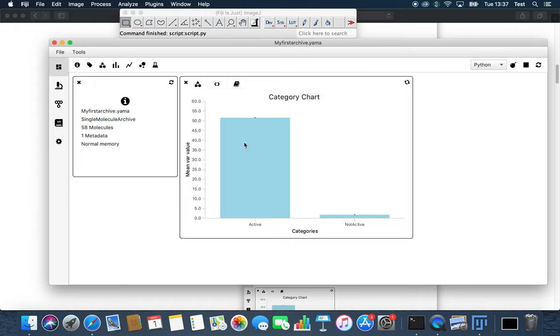With this simple tool of plotting and comparing, we can confirm our hypothesis. The variance for the active molecules is bigger.